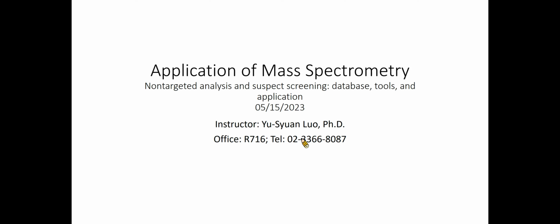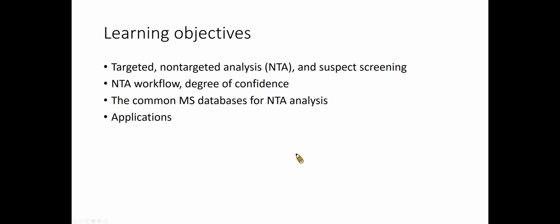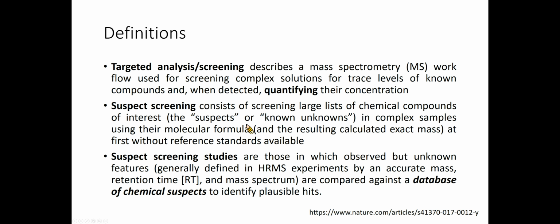Today's topic is non-targeted analysis and suspect screening, where we will talk about the databases, tools, and application examples. In this lecture, you will learn the definitions of targeted, non-targeted, and suspect screening, the non-targeted analysis workflow, the common mass database for non-targeted analysis, and the applications.